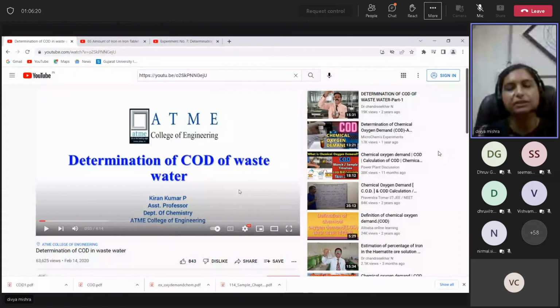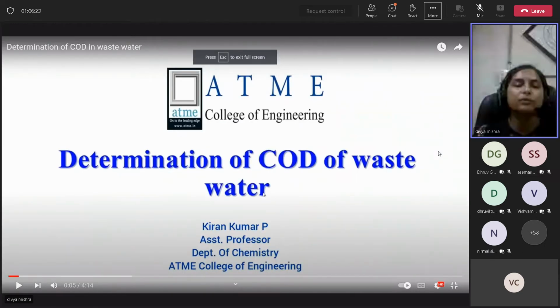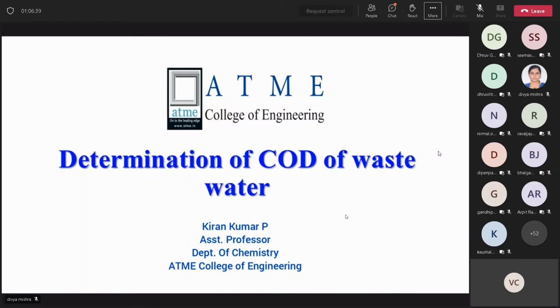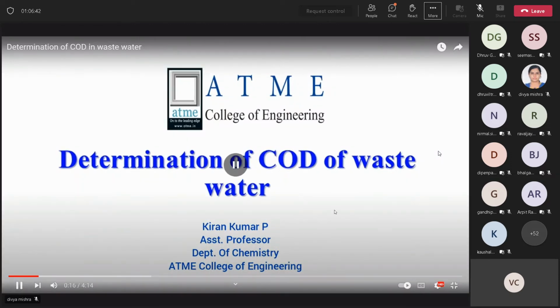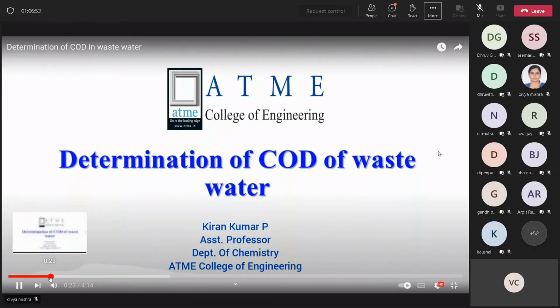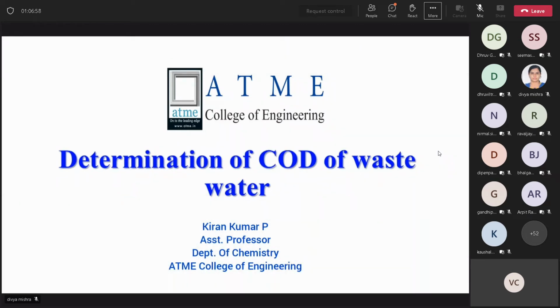Now we will see this video on how to perform the determination of COD of wastewater. Myself, Kiran Kumar P, Assistant Professor, Department of Chemistry, ATME College of Engineering, Mysore. COD is chemical oxygen demand. It is the amount of oxygen required to chemically oxidize all organic impurities present in a wastewater sample. It is expressed in terms of milligrams of oxygen per liter.